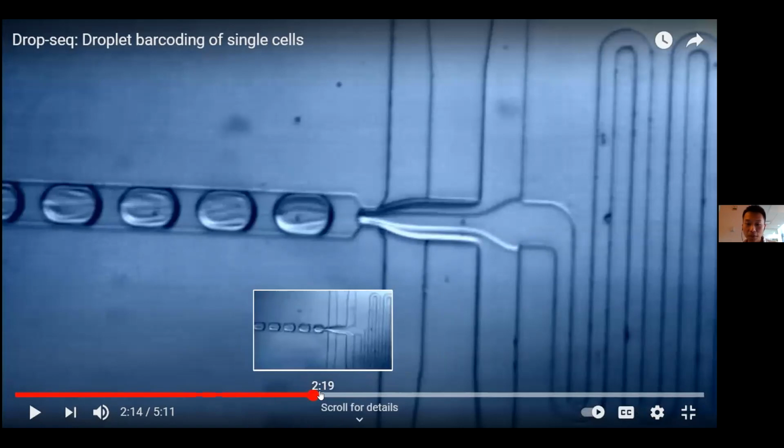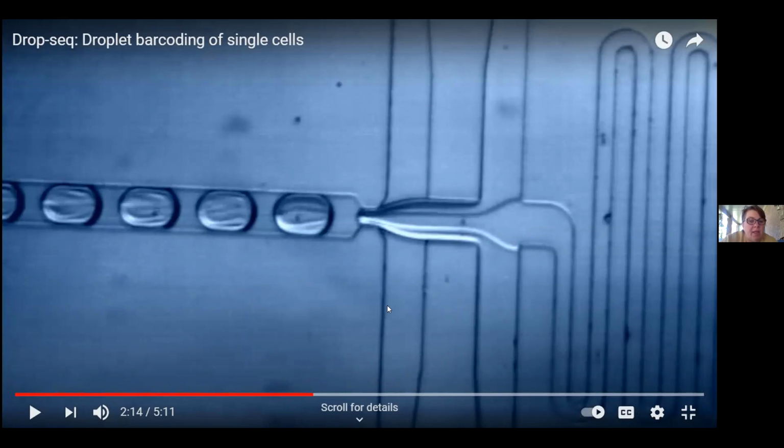And these would be the ones that they're actually testing when they ran the mouse versus human experiment. Yes, they were testing. They worked with the fluidics to get the droplet size to the point where it differentiated into either a mouse cell or a human cell. Okay, so as you can see, they optimized their protocol to make sure each of the cells will go into one droplet instead of two cells going into one droplet.